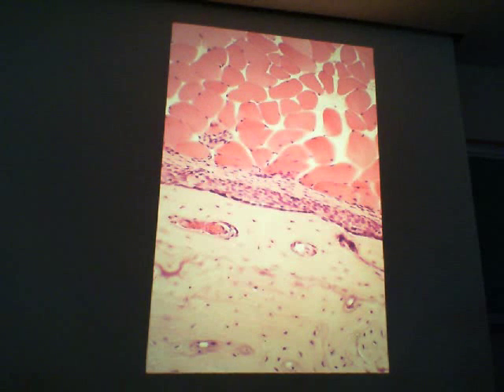And how about this tissue right here? What is this? Skeletal muscle. And right here, what is this tissue we have here? A little unfair. You can't really see the osteons very well, but this would be lamellar bone. And this layer right here, what is that? Periosteum. In fact, we've got a line of cells right there that are what? Osteoblasts. Okay, they were progenitor cells, except they've now assumed the profile of an osteoblast.